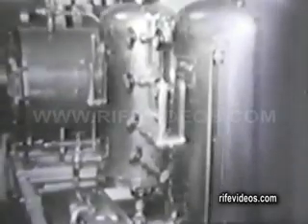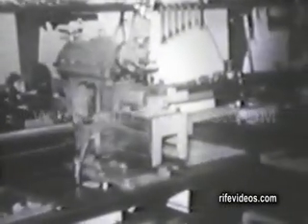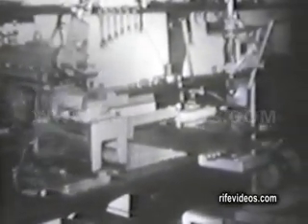There were many sterilizers in the laboratory, one being 15 feet long for the sterilization of glassware and other research items. These are hot water steam heaters. There was a complete machine shop in the laboratory for tool work, making microscopes, and providing any of the facilities needed for the research.